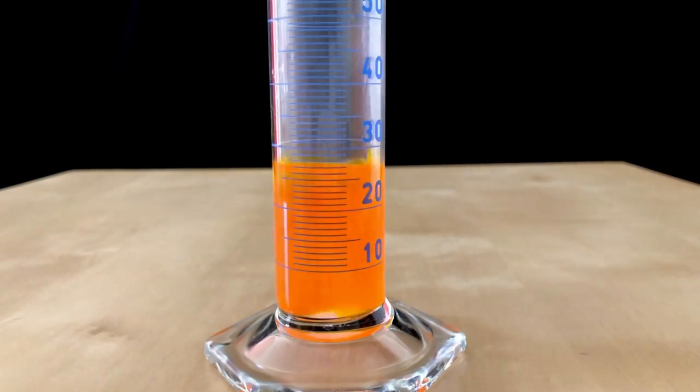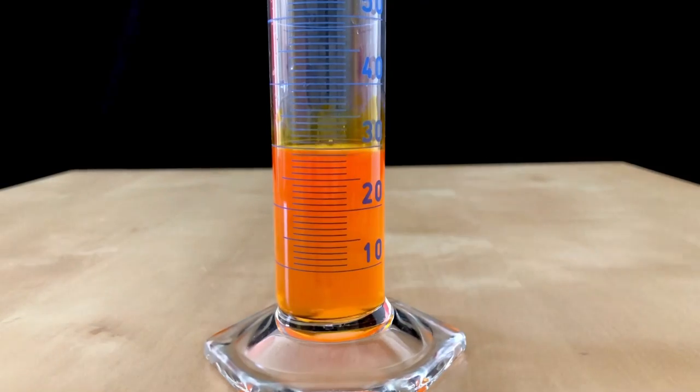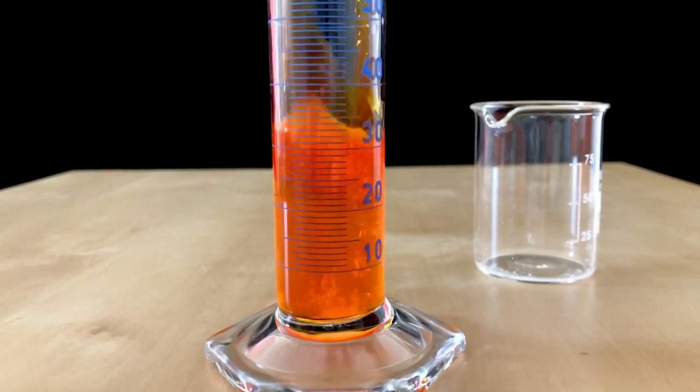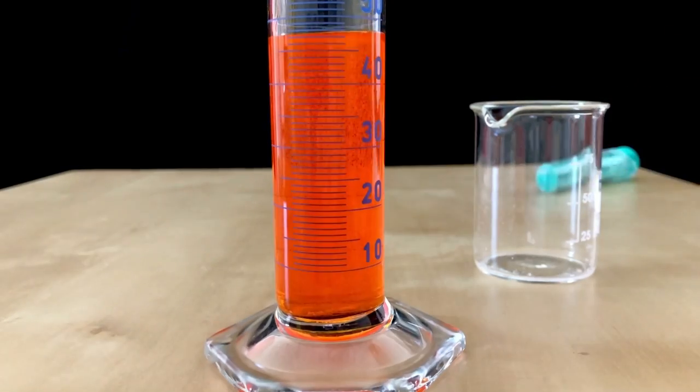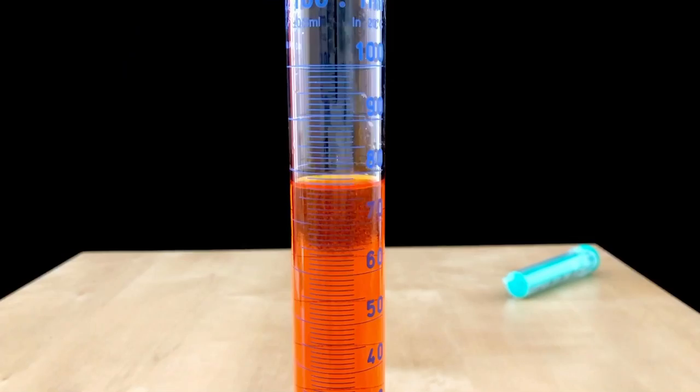When both of the solutions are combined you get this beautiful orange color. We continued by adding 20 more milliliters of glacial acetic acid followed by enough water to fill up the measuring cylinder to the 100 milliliter mark.